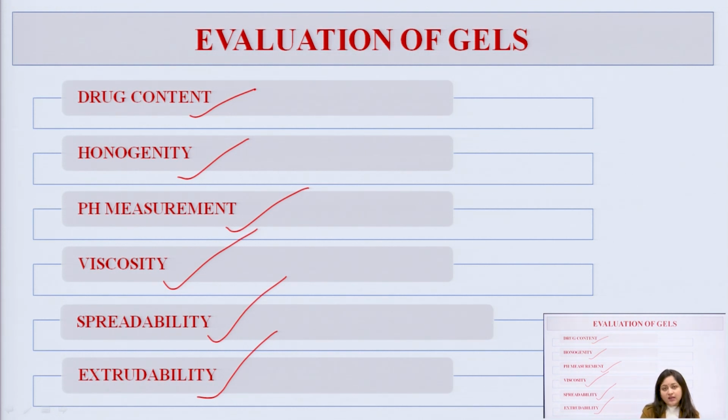In order to analyze the drug content, we usually perform the release of medicament through the dissolution apparatus at regular intervals of time. Aliquots are taken. These aliquots are examined under a UV spectrophotometer, which takes the absorbance through which we can understand the concentration of the drug at a particular interval, which helps us analyze the presence of drug content throughout the shelf life. Thus this test is an estimation of the efficacy of our product, and it is a very important and vital test.